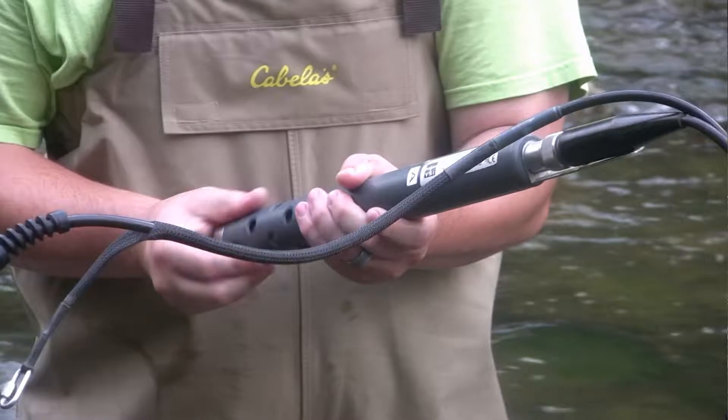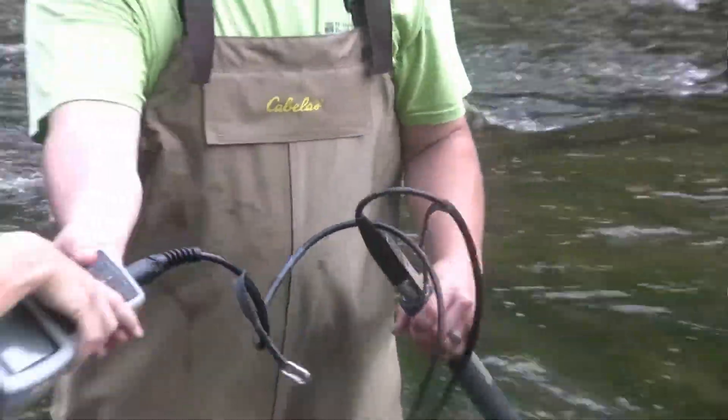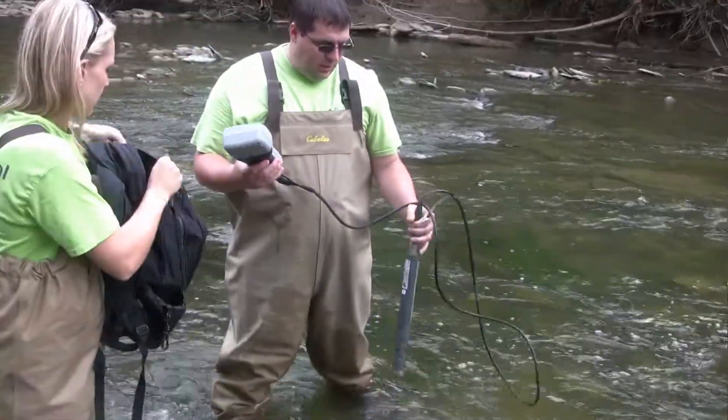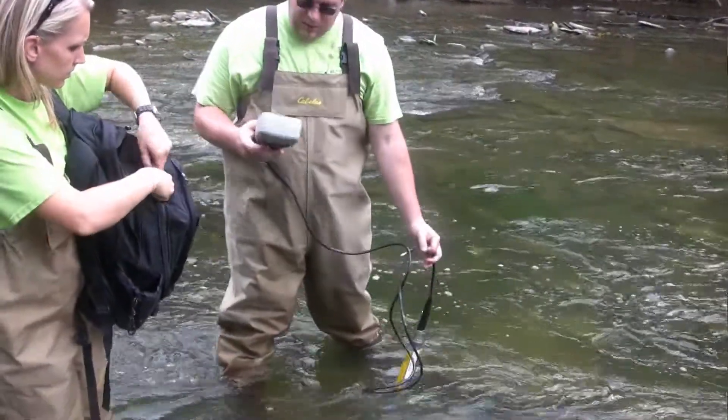This is measuring things like temperature, dissolved oxygen or DO, and pH.